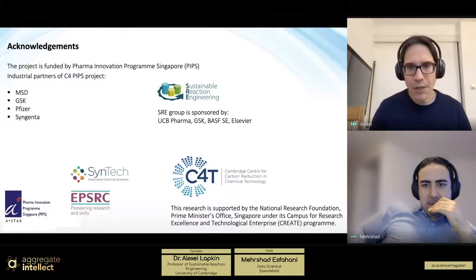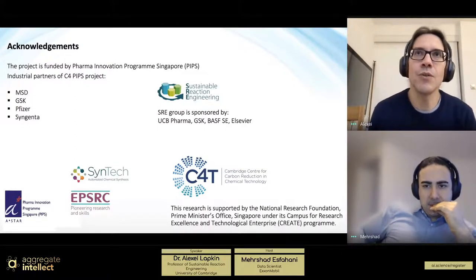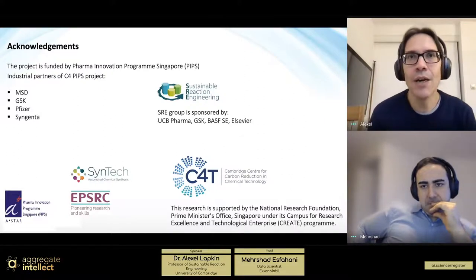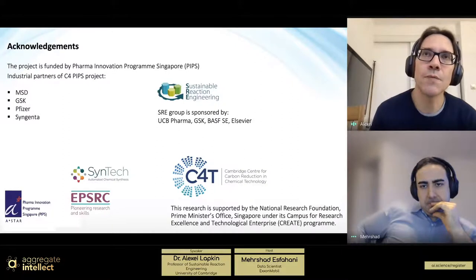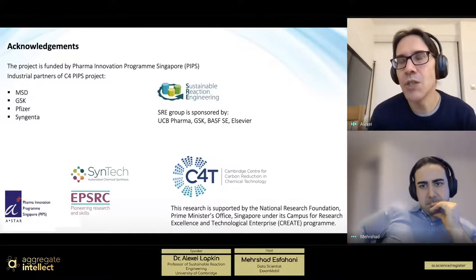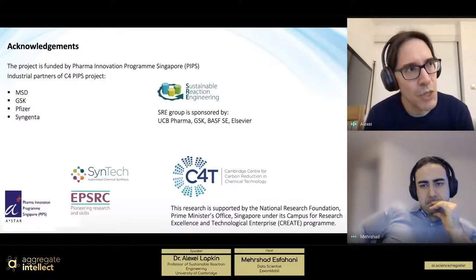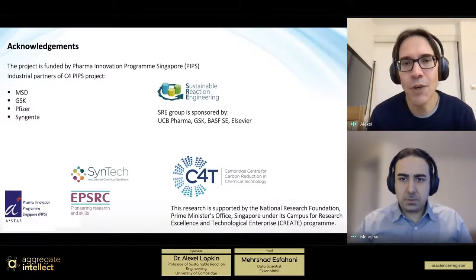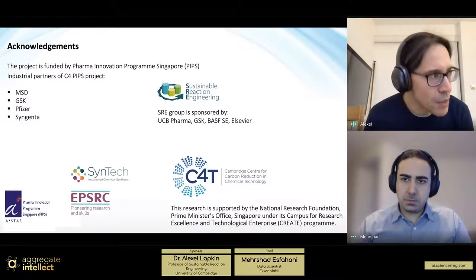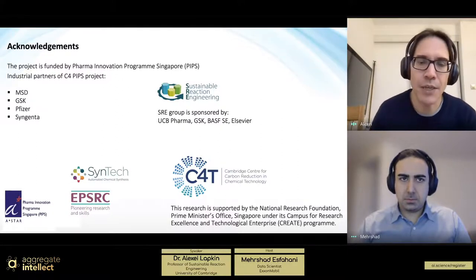It's visual. This is how it's done in industry. Formulations are characterized by the stability over time, and it's basically your observation of the change of turbidity over time. The unstable formulation will basically layer out, and if you have an expensive experiment, you have cameras which take images with different exposures and different lighting. We take one image, so our measurements are not very accurate, but they still give us an indication. So we have an image with image analysis and we have a turbidity sensor. We take these two measurements together. Whereas in commercial setups for analysis of stability, they measure turbidity and multiple images which they combine together into a single indicator later on.